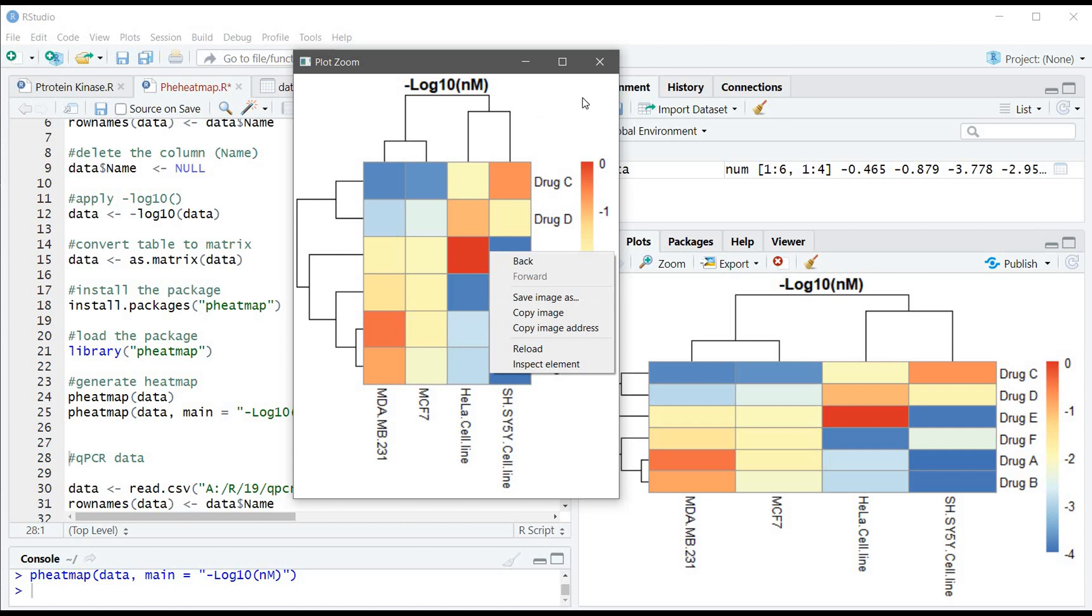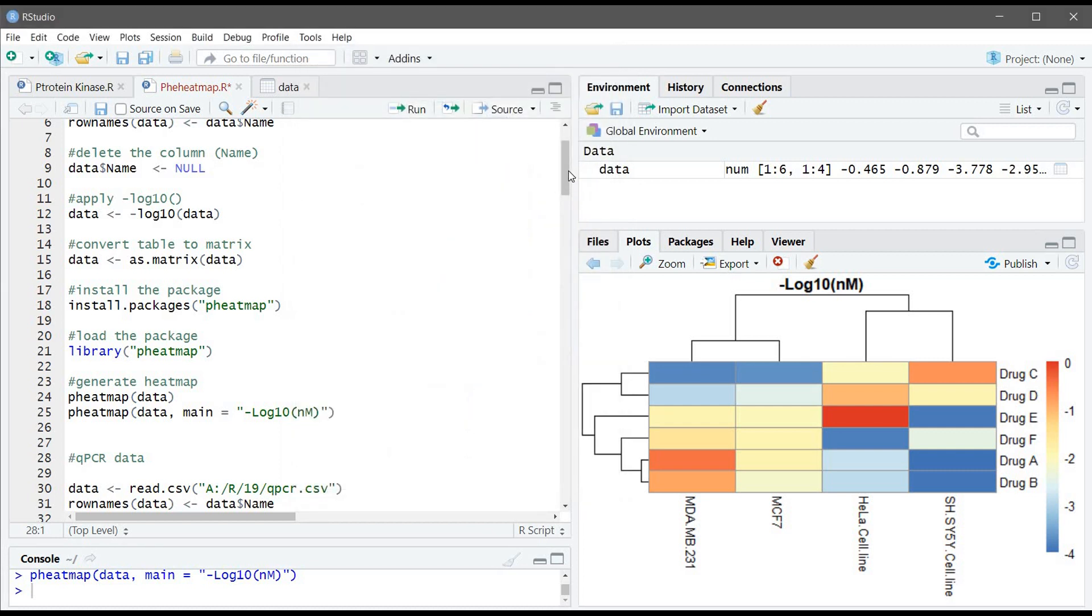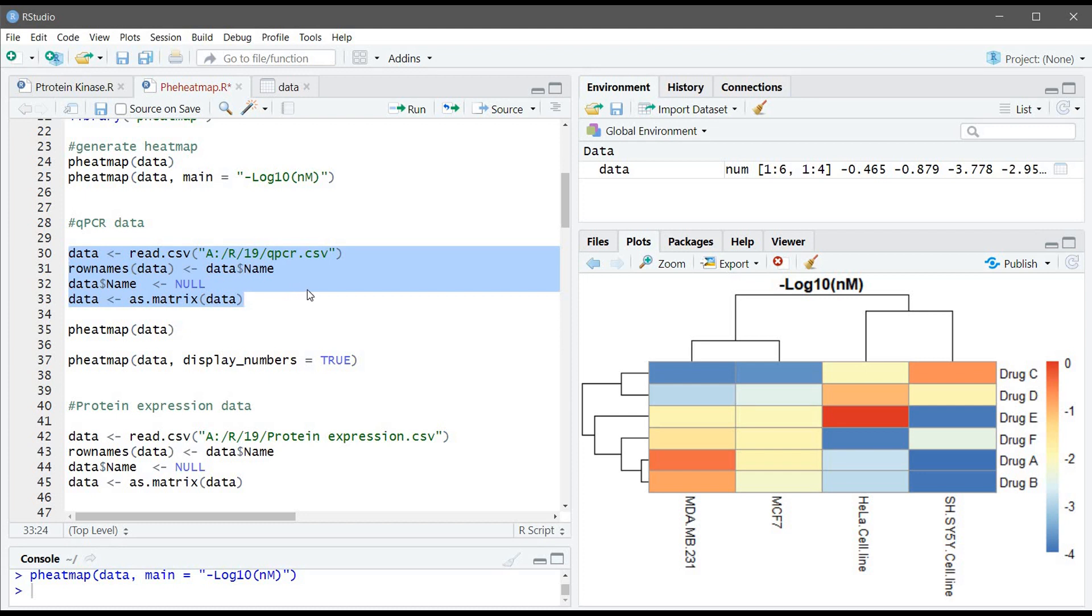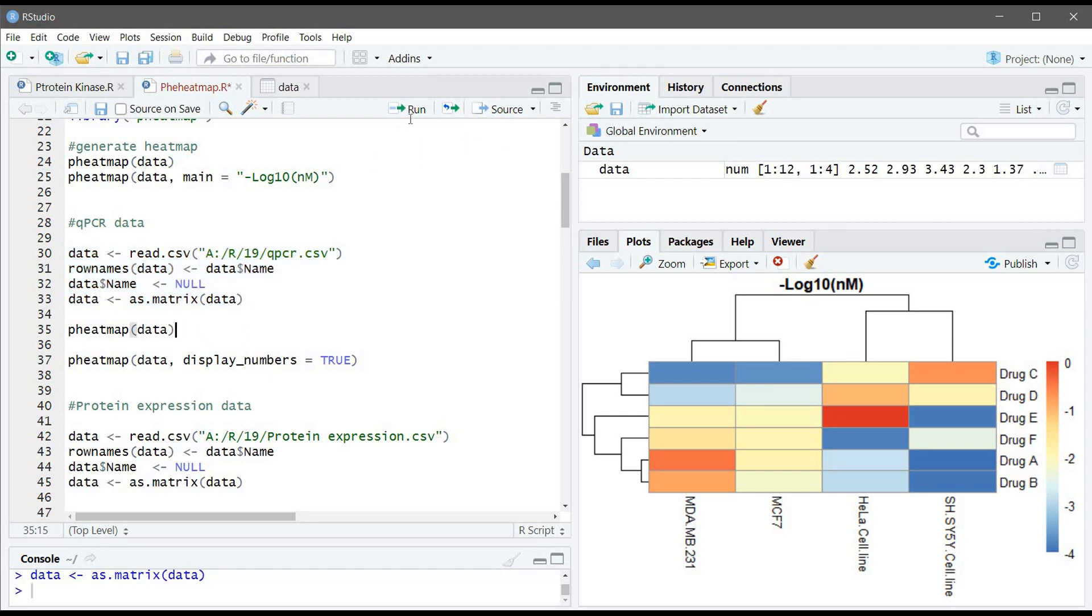So the second example is the qPCR data. The arguments are similar to the previous one but here we didn't use the minus log10 function because we are really interested in the data and there is no big difference like the IC50. So we will run this command and generate the heatmap for the qPCR.